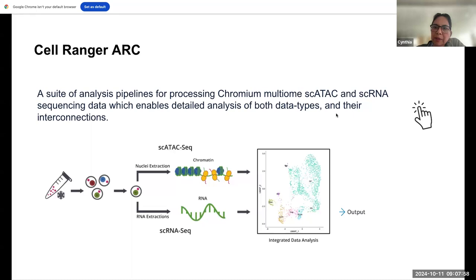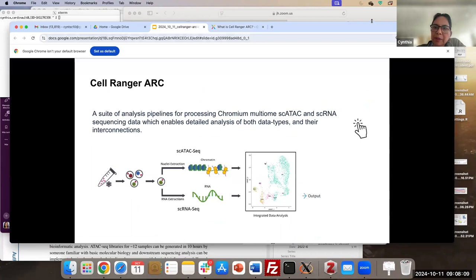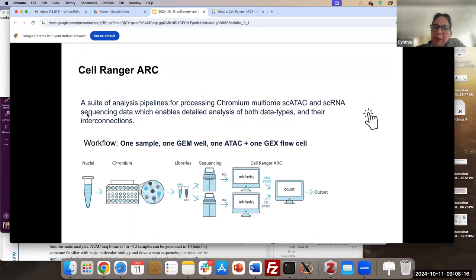There is a lot of information related to this, and I've added some icons where we can look at different detailed information. Next, this is an example only to show the workflow. We have different workflows when running Cell Ranger Arc. This example is for one sample, one GEM well, one ATAC and one gene expression flow cell. You can see we have the nuclei and the GEM chip with information associated with chromatin accessibility and gene expression. So we have two different libraries, each one for either of these data types.